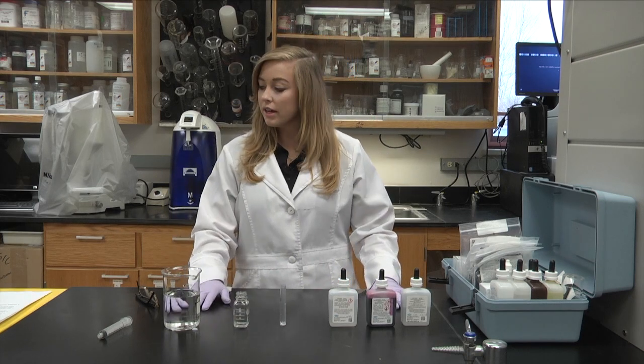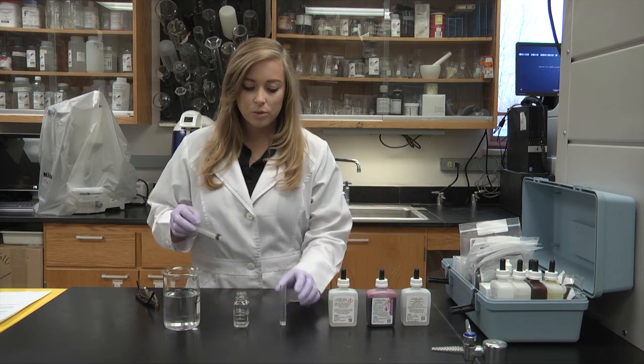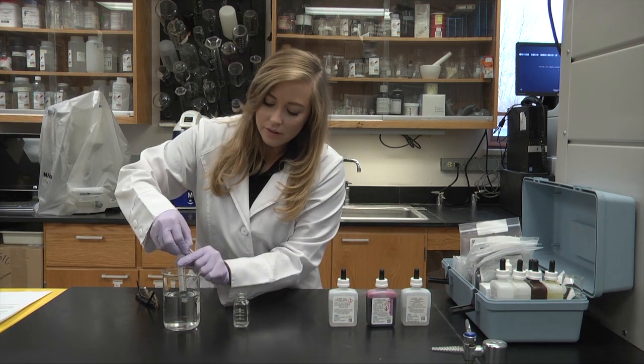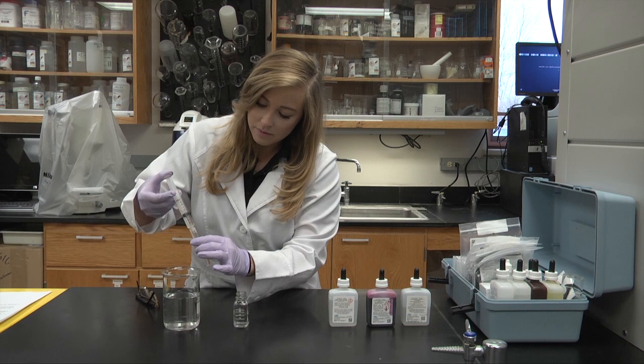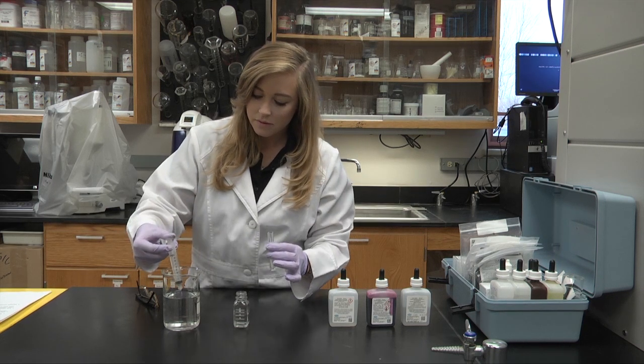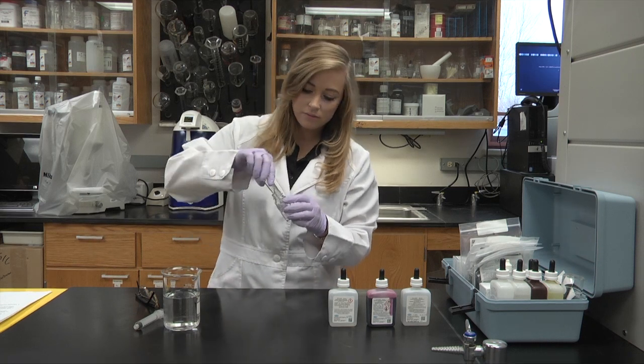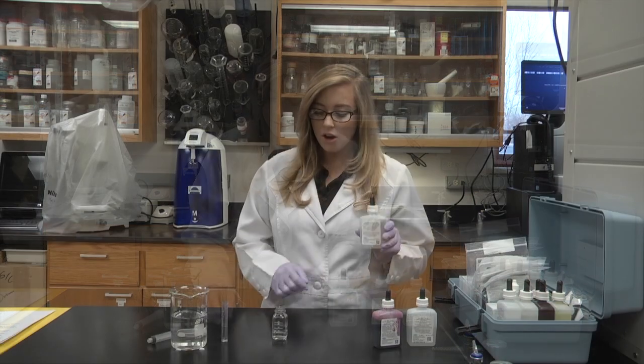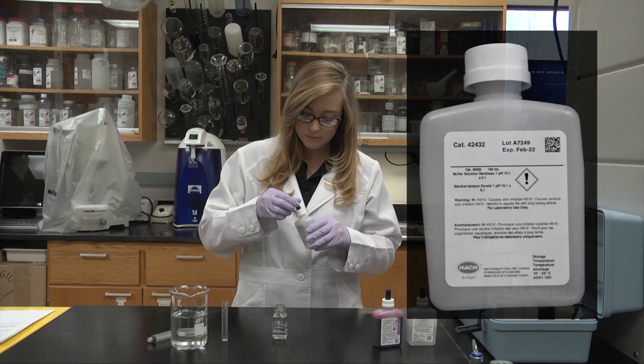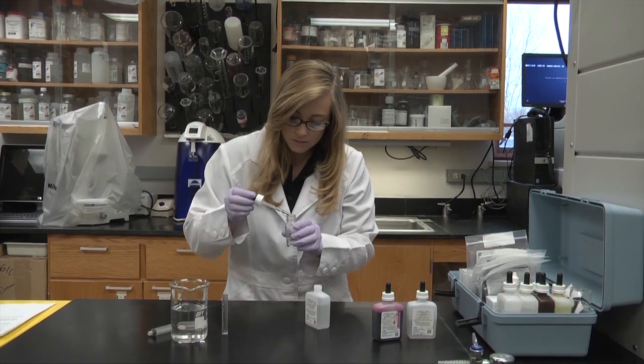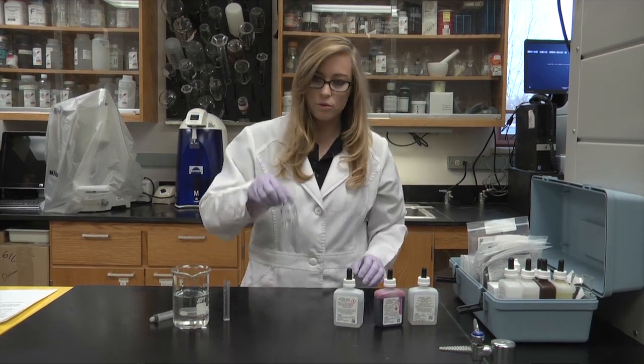First off, we're going to do hardness, and hardness is the amount of calcium and magnesium found in the water. So we'll take our plastic tube and fill it full of water. We will then put it in our mixing bottle. Now we're going to add three drops of the buffer solution, hardness one, and then swirl to mix.